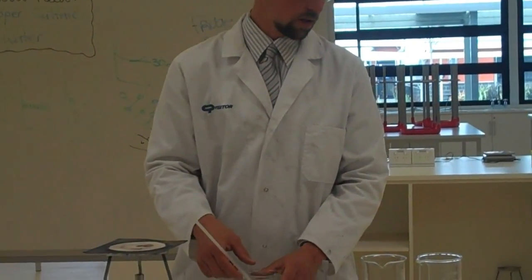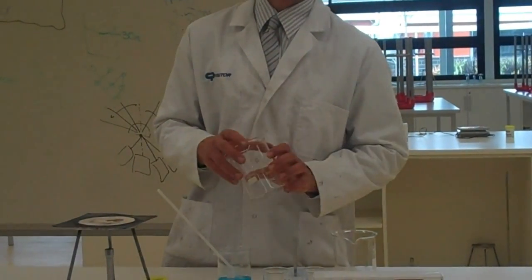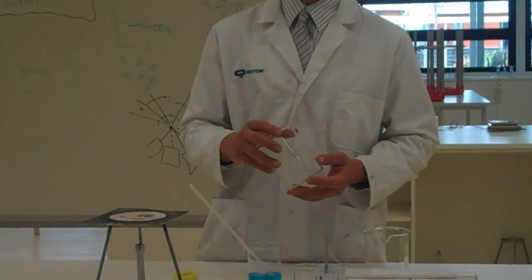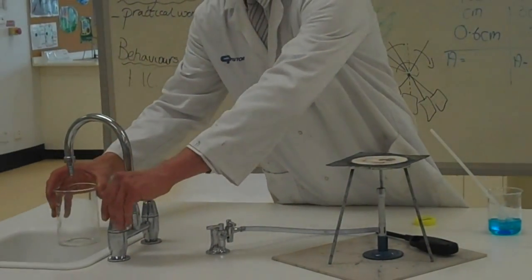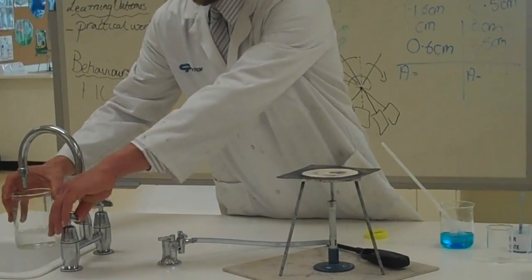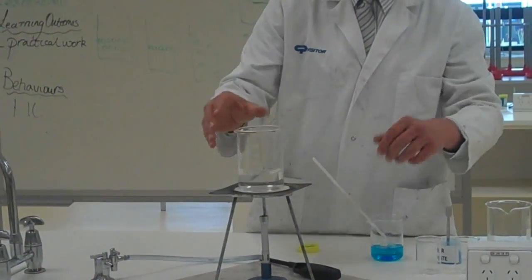While I'm waiting for that to dissolve, I'm going to fill this beaker with a little bit of water and get that heating up, because I need some hot water later on. So I'm just putting that on the Bunsen burner.